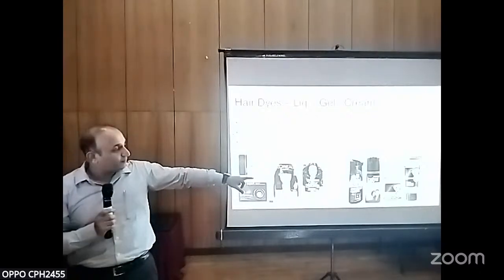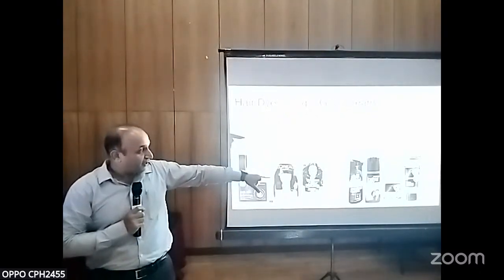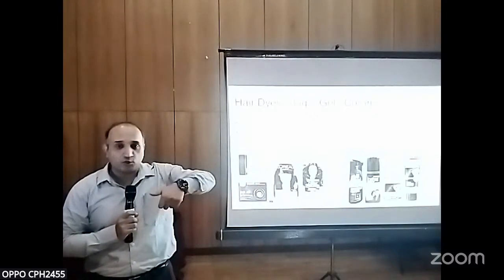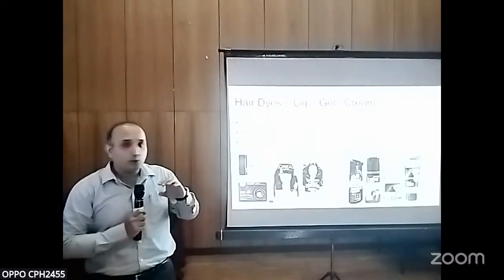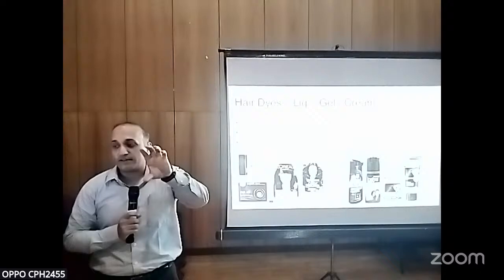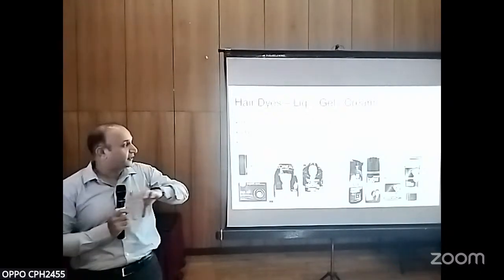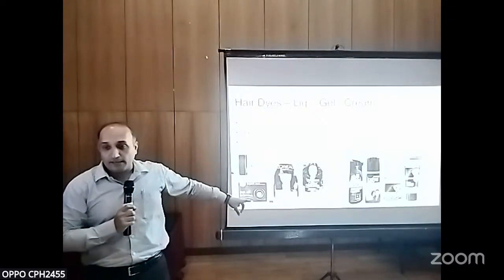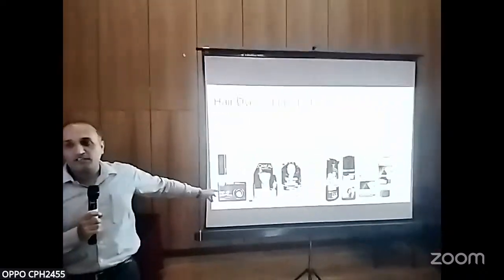The analyst here has to identify that whenever you get a shampoo and you actuate it, you will be getting the dye and developer both. So you will not be able to exactly estimate what is the dye content in the dye precursor as such. Only in the dye bath, what is present, only that can be estimated. Whereas in the cream format, you will be getting separate dye and separate developers. In that, the estimation will be very, very easy.